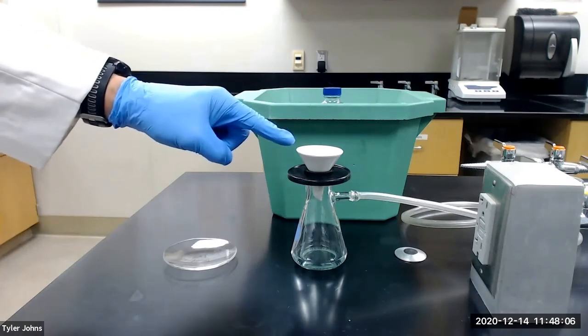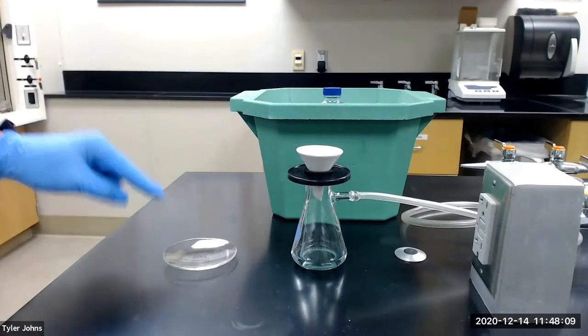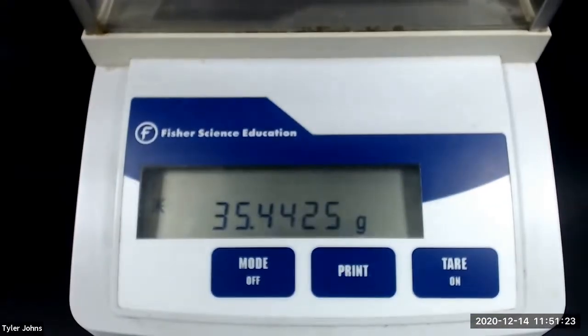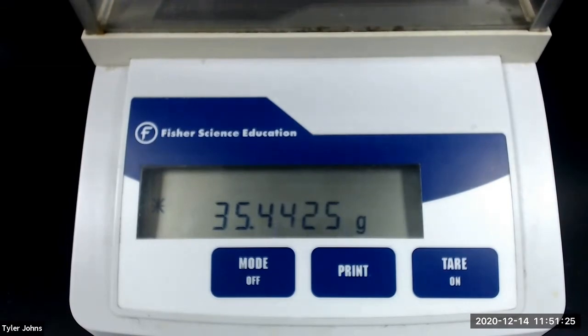While the benzylic acid continues to dry, we will pre-weigh a watch glass. This is 35.4425 grams.